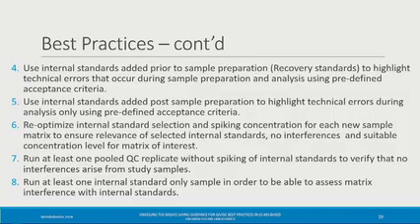I have a short comment. So in my experience, when we use the word internal standards in the targeted community, people assume that you are quantifying something. And just to avoid this misunderstanding in the untargeted metabolomics, how about using technical internal standards just to separate them from the internal standards which are used in the targeted world? So that's just my comment. Okay, excellent comment. Yeah, we are struggling a little bit with nomenclature as well to make sure we are consistent, and I like that idea, so we will discuss and get back.